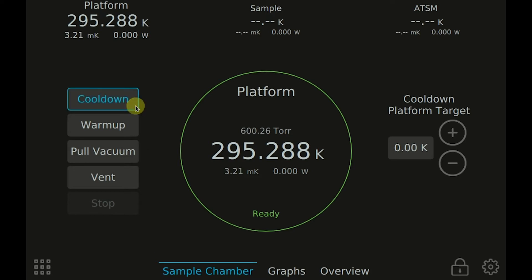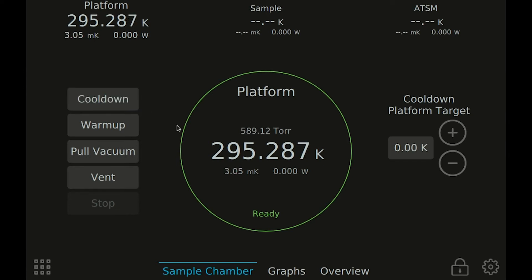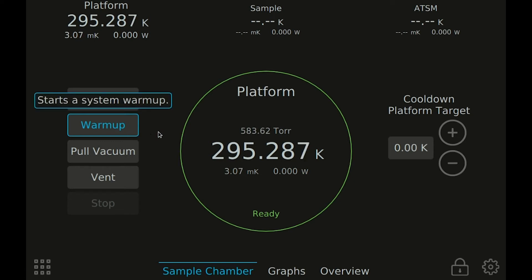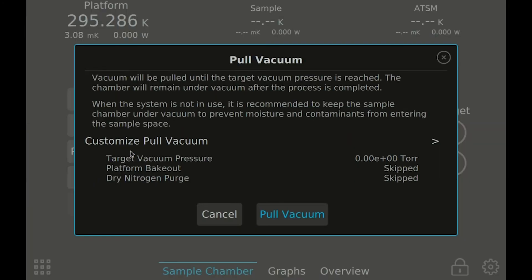Buttons in the system can be pressed and held to get pop-up help text to explain what the button does. Slide your finger away from the button to cancel. Any button that causes a major change in the system state will pop up a confirmation dialog to double check with you before making the change.